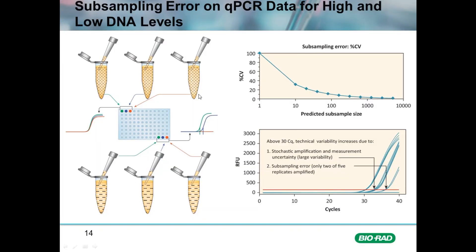Subsampling error is a major source of error that occurs when working with very low abundant cDNA or genomic DNA samples. In this example, we have three technical replicates that contain a large amount of the target, represented by dashed lines in each of these tubes. Each tube represents a technical replicate from the same biological sample pipetted into a qPCR plate. When there are a large number of target molecules, the data in the amplification curves is very consistent — all three amplification curves virtually overlap, as would be expected with technical replicates.